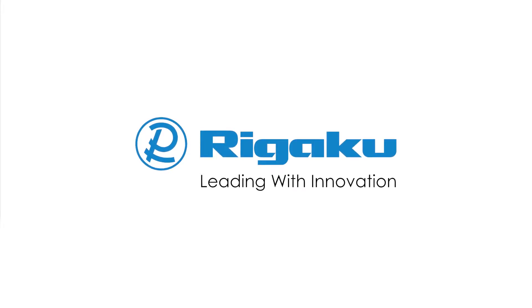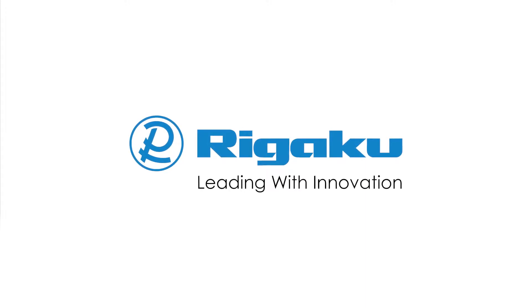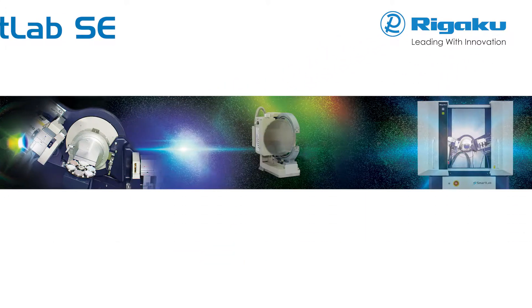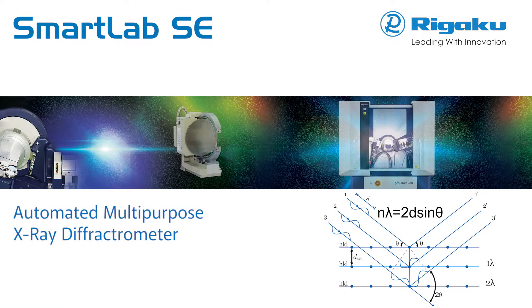Rigaku, the world's leading analytical X-ray instruments company, offers a highly versatile state-of-the-art multipurpose X-ray diffraction system with built-in intelligence guidance.